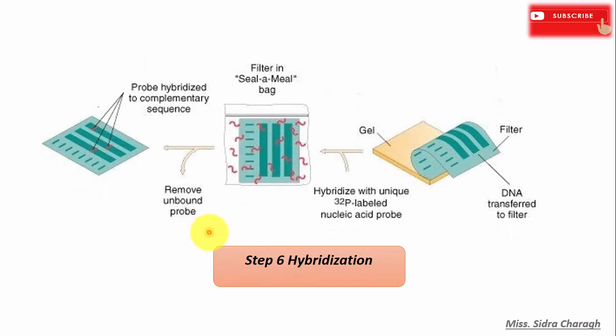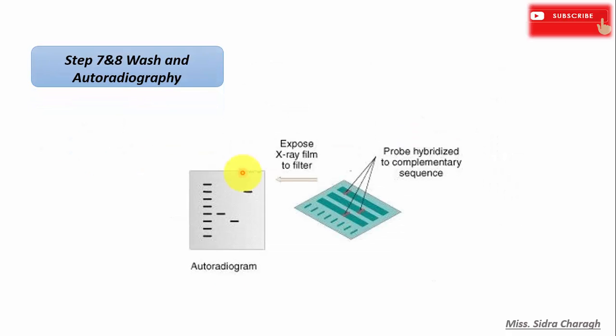After blotting, hybridization is performed. In hybridization, the membrane is exposed to the probe, which is a single-stranded fragment with the specific sequence whose presence in the target DNA is to be determined. The probe DNA is labeled so that it can be detected, usually by incorporating radioactivity or tagging the molecule with a fluorescent label. Then after hybridization, the membrane is thoroughly washed with a buffer to remove the probe that is bound non-specifically or any unbound probes present.